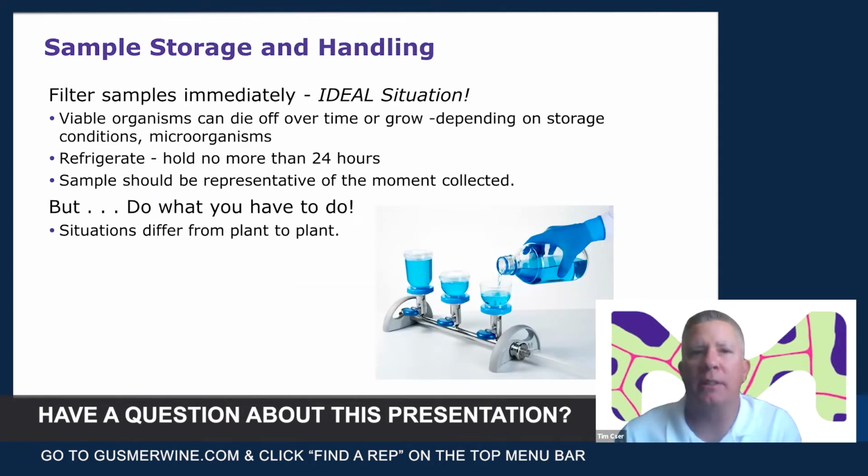So what do we want to do with our sample? We want to filter it immediately if we can. That way you're getting a real story. What's in your sample? What is growing? What could still be revived? Other stuff might be dead and not revivable, but it will give you the best picture. Now, if you have to hold this for 24 hours in refrigeration temperatures, if you have to do it, you have to do it.